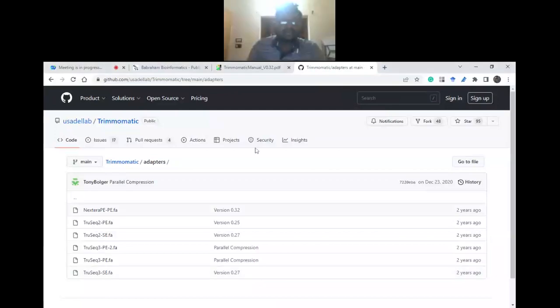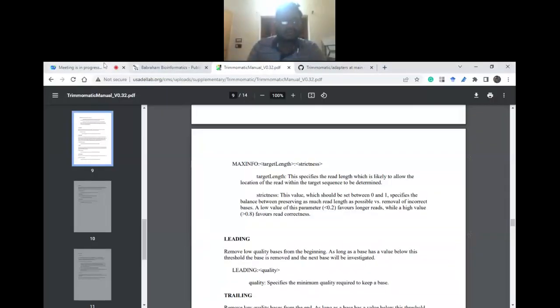So let's go back to FastQC then. Let me share the screen.